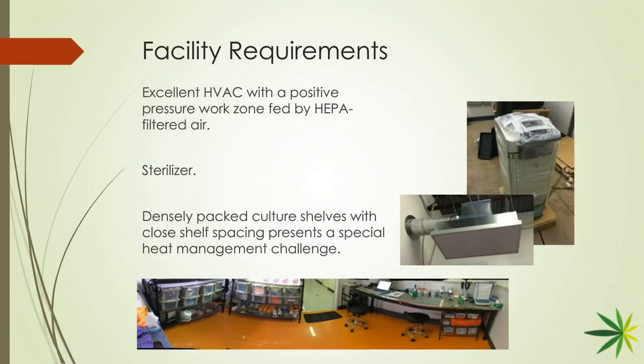You see some pictures there of the ceiling, that middle facility there. That's just a HEPA filter on the end of a duct, and it recirculates most of the air in the room and then draws in about 10% of the air from the outside. The rest of the fan's blower capacity was just recirculating air in the room through that HEPA filter.